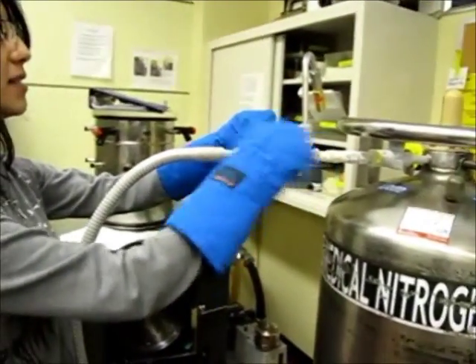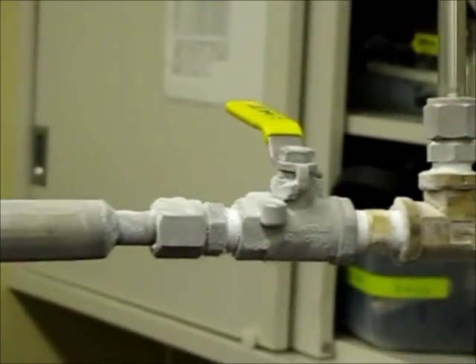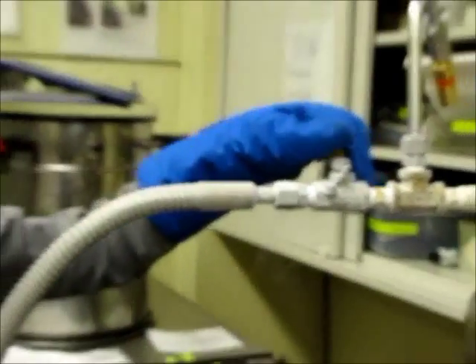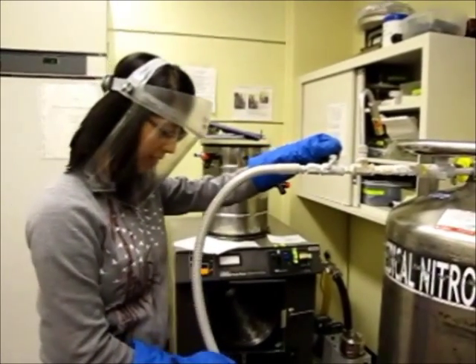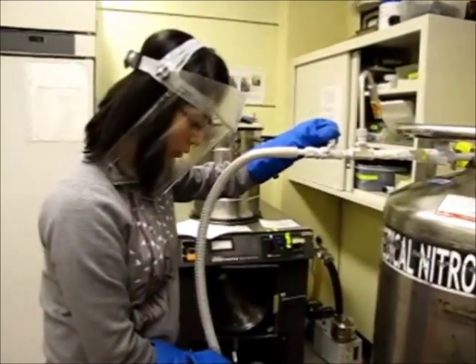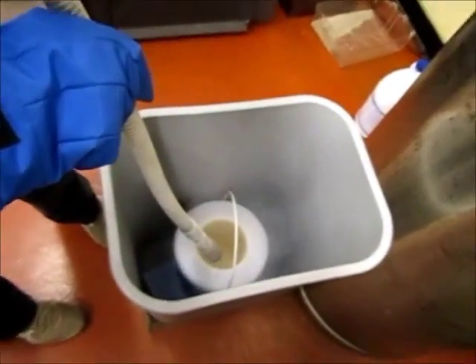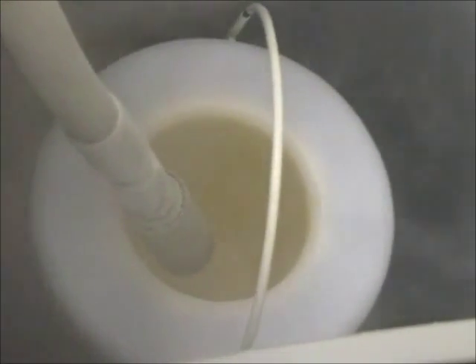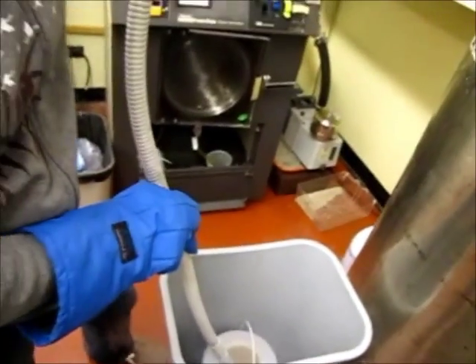You will be using this lever to open the tank. I will now put on the face shield. Pull the lever towards you slowly. Make sure to put the nozzle inside the container and hold it in. Fill the container slowly.